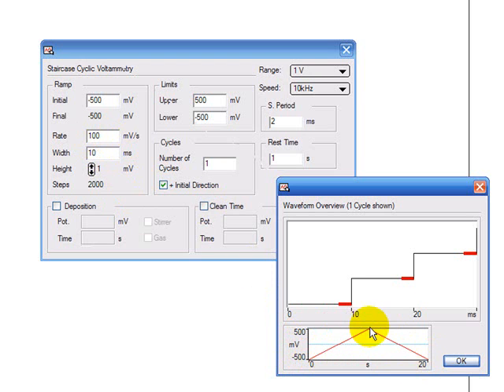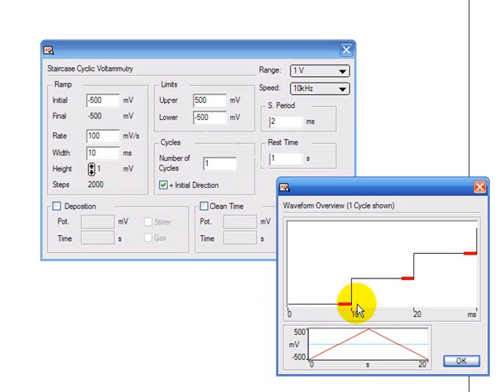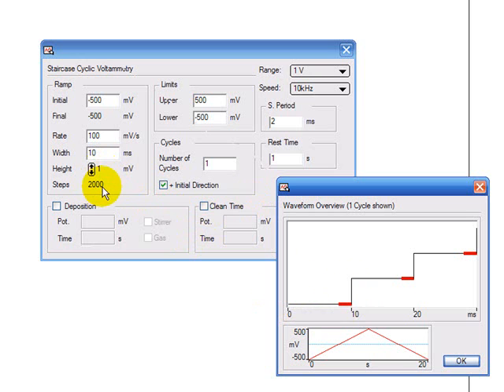To go up and down the voltage is going to take this staircase and you can define the width of the step, so 10 milliseconds here and the height of the step, 1 millivolt here. The software is going to take 2000 of these steps to go up and down.